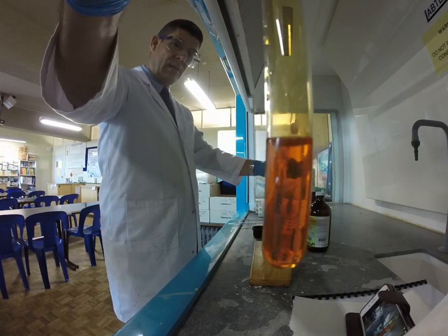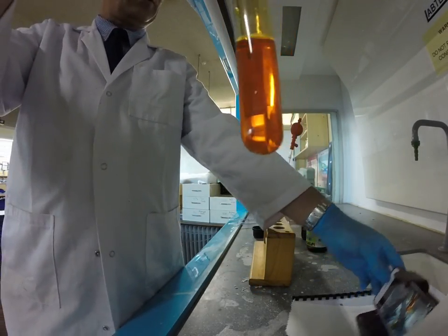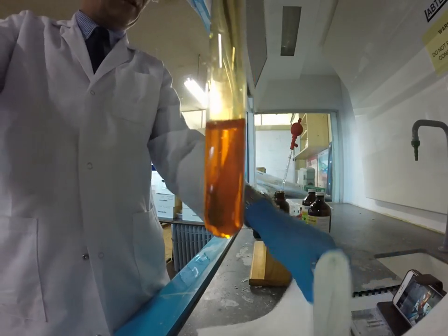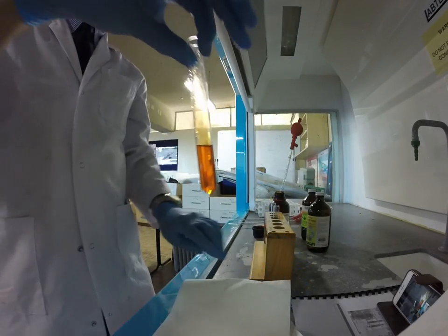There's the colour of the bromine water, and at this stage I haven't reacted anything with it. If we just move a small white object behind it, you can see the colour of the bromine water — that's what it looks like as our starter.